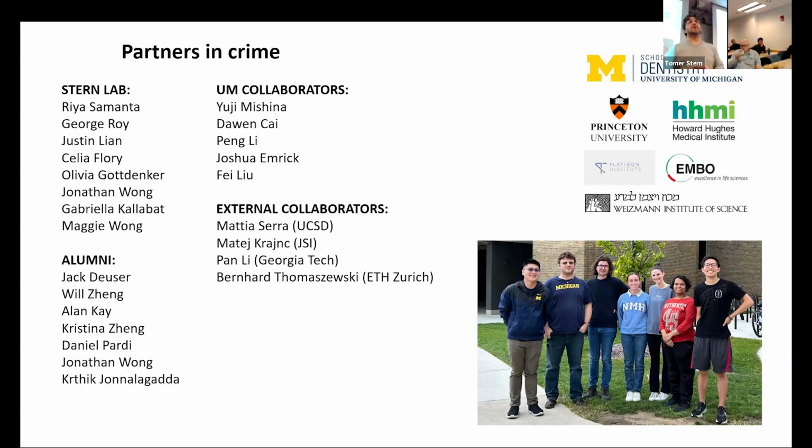Okay, so look, in general, yes, there are problems. Segmentation and tracking is becoming a field. Every week on ResearchGate, you see like 5 new papers, and every 4 months, a big new paper. So it's really a hot thing now. So if there are problems, it's as much as you have in sequence analysis.